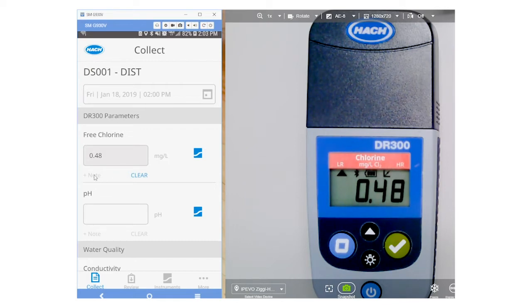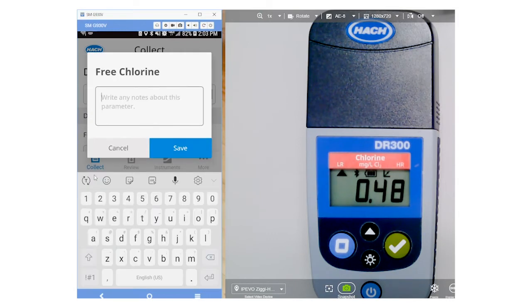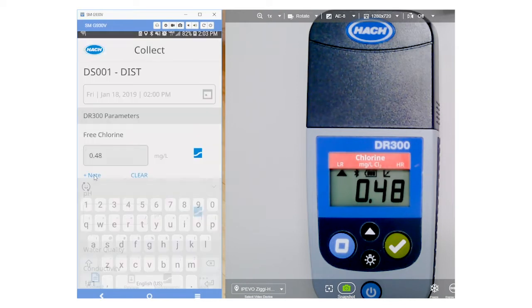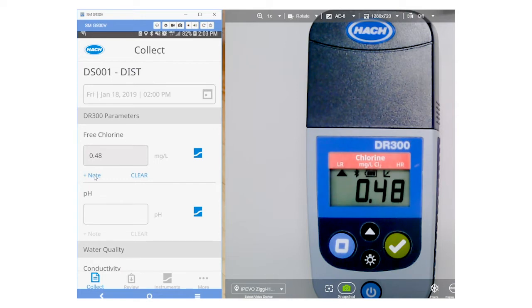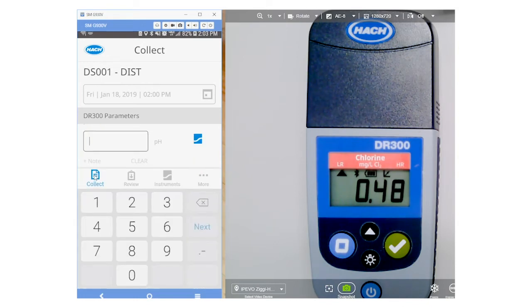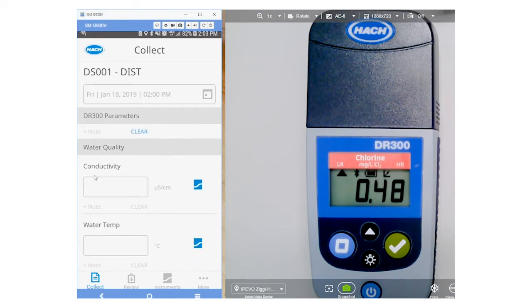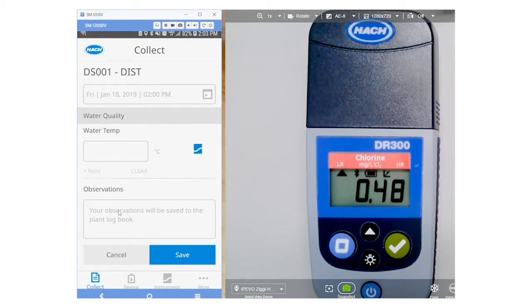In this case, I want to add a note in, so I'm going to click Add Note. And I want to mention that I let the tap run for 5 minutes. I also can collect any other data that I need out in the field. In this case, I'm going to collect my pH. And I don't need to take the water quality parameters this time. So I'm going to scroll to the bottom, and I've got a Save button right there.